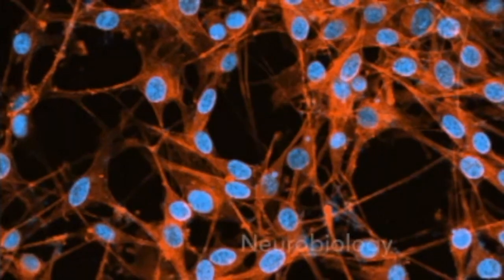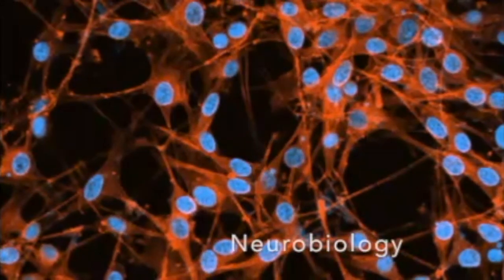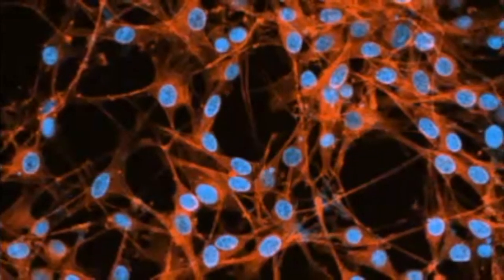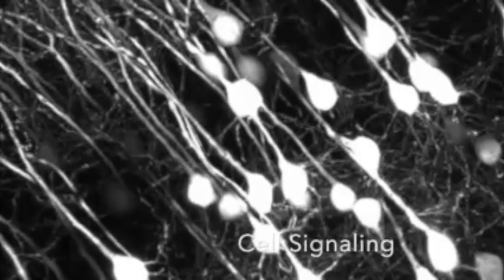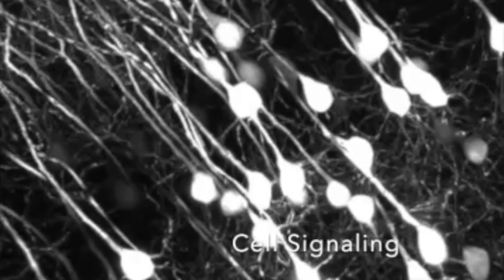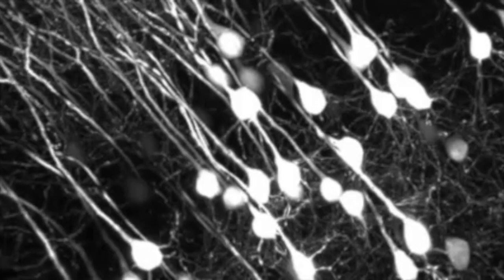In the field of neurobiology, a combination of confocal microscopy, optical sectioning, and 3D imaging allows scientists to view cells of the nervous system deep into brain slices and tissues. Confocal and fluorescence microscopy is an essential tool for researchers studying cell signaling because it allows them to analyze tissues and cells to identify molecules of interest. Software allows the recording of real-life imaging over time and the generation of 3D images or videos. Specific settings when using the microscope can be programmed through the software so that with the click of one button, all the necessary parameters will be set automatically.